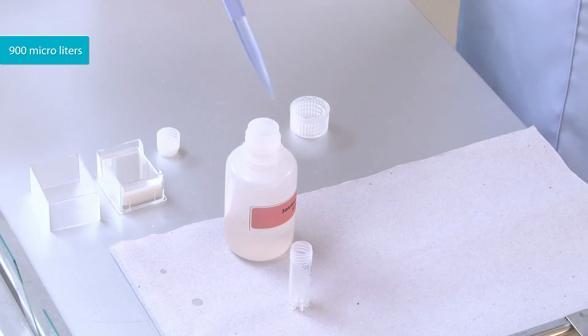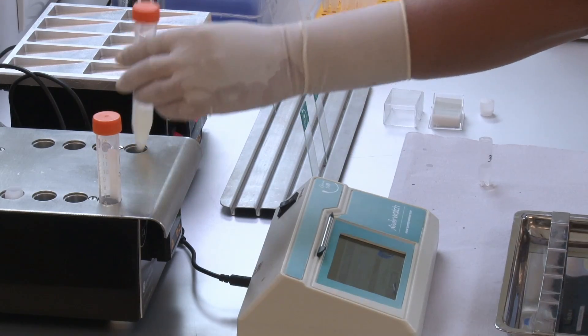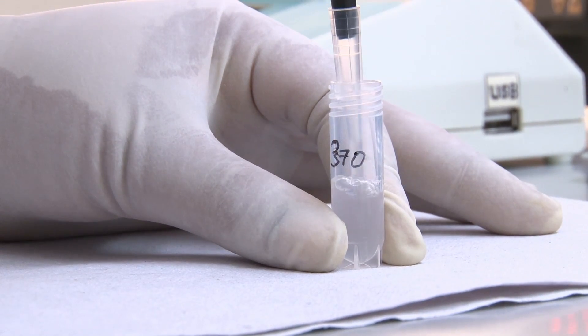Put 900 microliters of solution A in the microtube. Add 100 microliters of liquefied semen to the microtube. Mix it well.